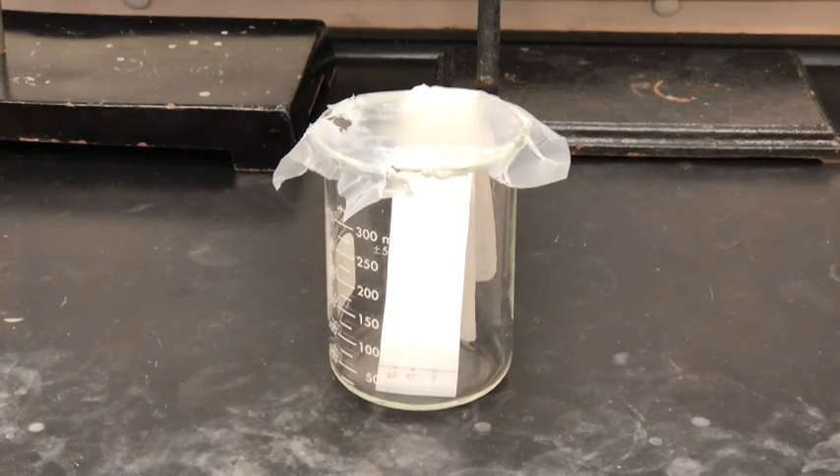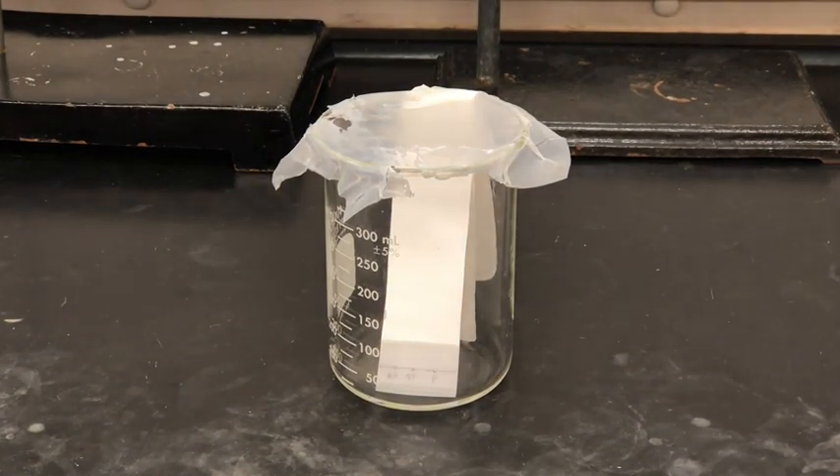You can already see the solvent traveling up the TLC plate. As the solvent travels up the plate it's also pulling along the reactant molecules and any product molecules that might be present. The molecules will travel different distances depending on how well they interact with the TLC plate and the solvent, so each molecule should have its own distinct distance it travels. We'll let this run and I'll show you what it looks like once it's done — I'll also fast forward the video so you can watch the solvent rise up to the top of the plate.